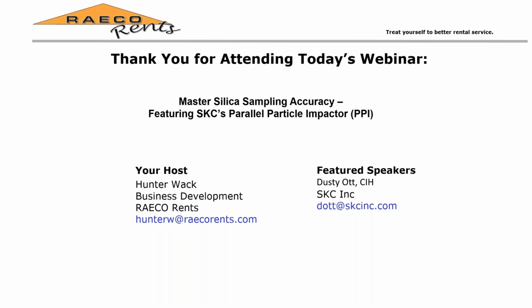Our presenter today is Dusty Ott with SKC Inc. He is going to give us an in-depth look at how to sample using a SKC Parallel Particle Impactor for silica sampling to ensure that your silica monitoring projects go smoothly. Some topics they will cover today include understanding how size-selective samplers work and why they matter for silica sampling, learn what makes a SKC PPI unique and how it performs compared to traditional cyclones and cassettes, break down the true cost of sampling, including the risk of quote-unquote bad data, gain practical tips for successful field use and data interpretation.